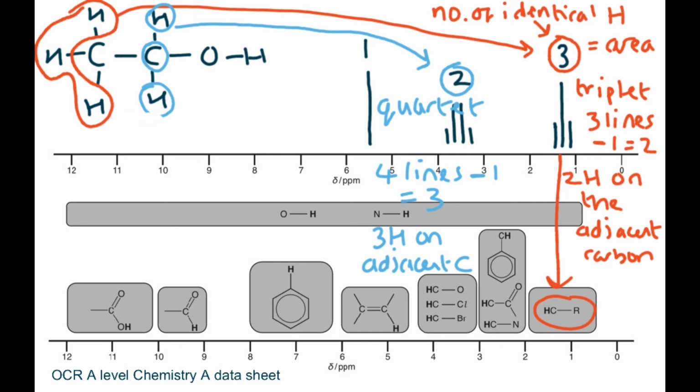Then we see what type of proton it is. You come down to your table here, and there's lots of protons there. We know it's not the halogens because there isn't a halogen in there. So it must be HCO. And we look, is that correct? It is correct, HCO. What type of hydrogen is it? It's a HCO. That fits as well.